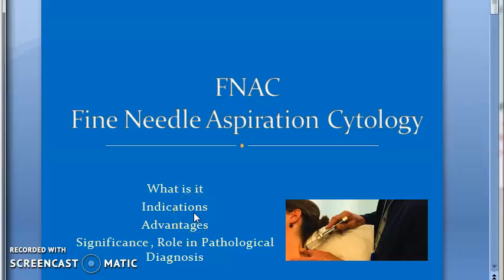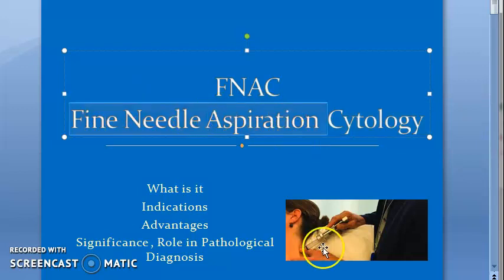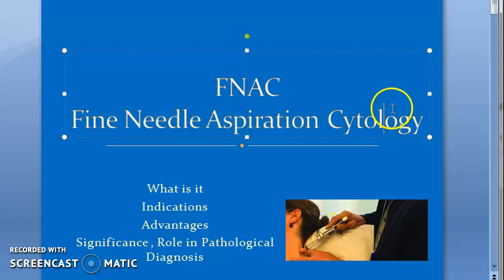Hello, welcome. In this video, we will look at FNAC. FNAC means Fine Needle Aspiration Cytology, that is the study of cells. So how are you retrieving the cells to study? By fine needle aspiration. You're going to put a fine needle, aspirate the cells and then study the cells. That is cytology. So fine needle aspiration cytology.